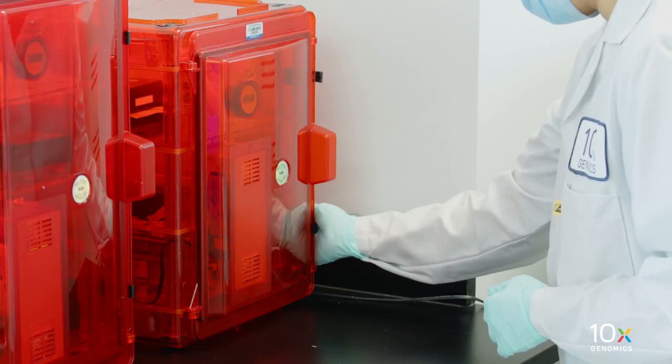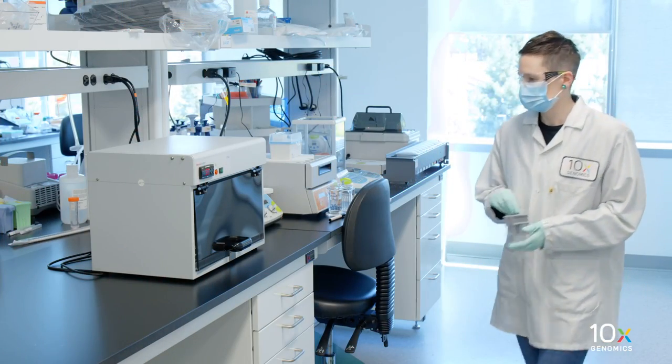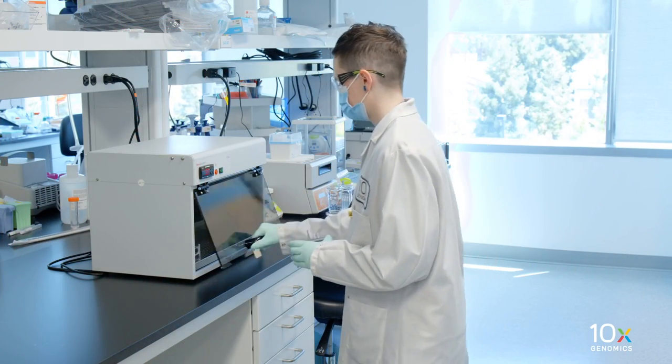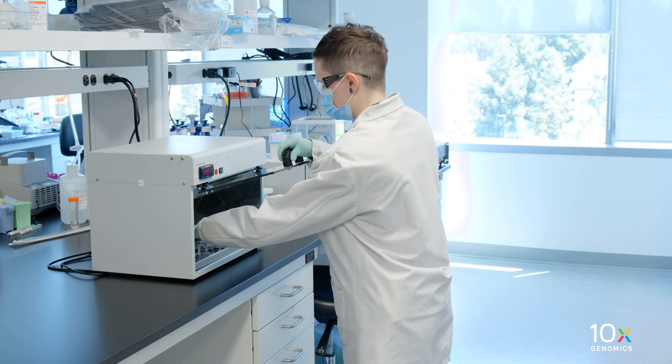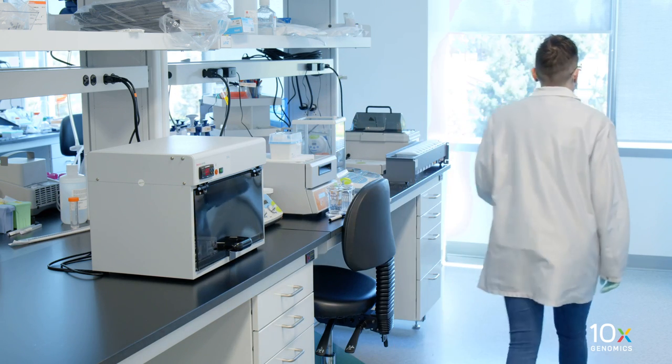Retrieve the slides with the tissue sections from the desiccator after overnight drying. Place the slides sideways in a slide rack in a section dryer oven and incubate uncovered at 60 degrees Celsius for two hours. Keep the oven lid closed during incubation.